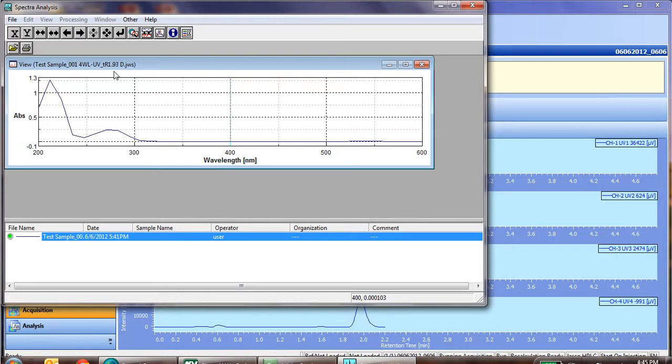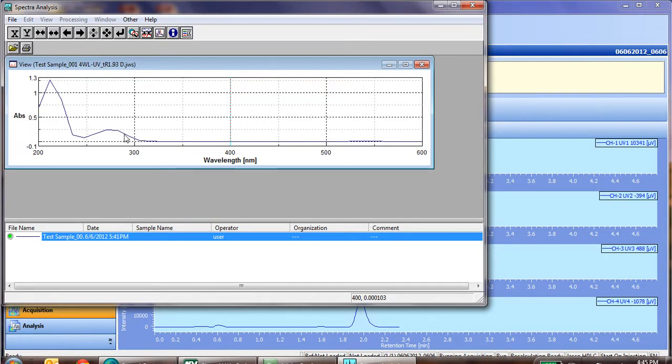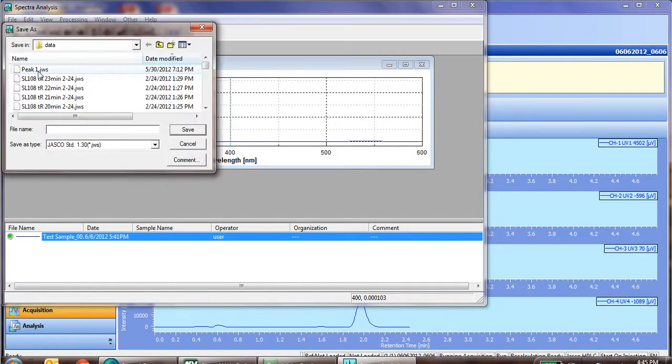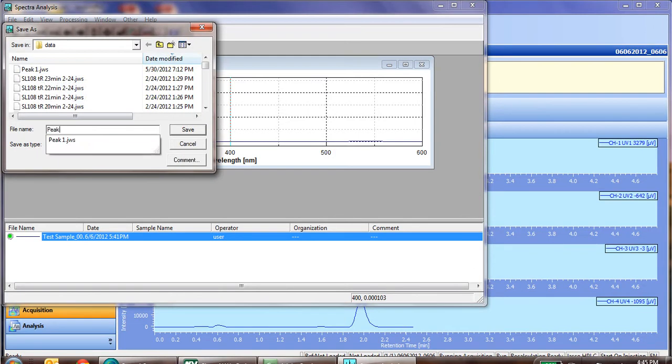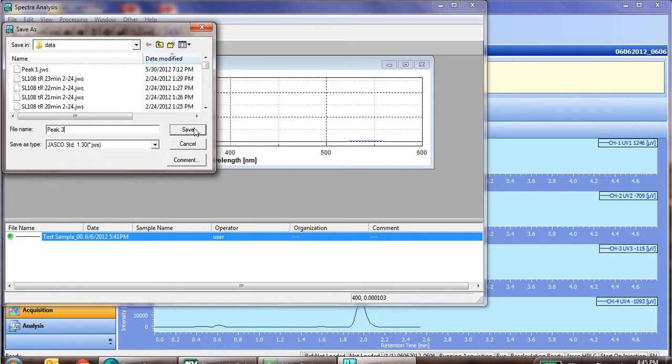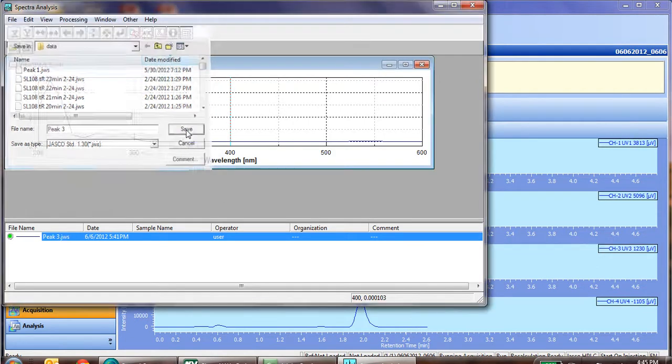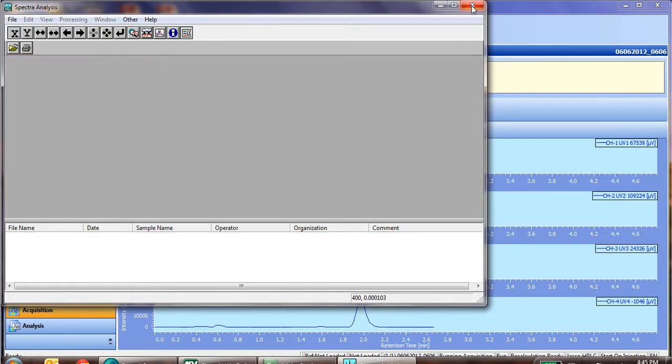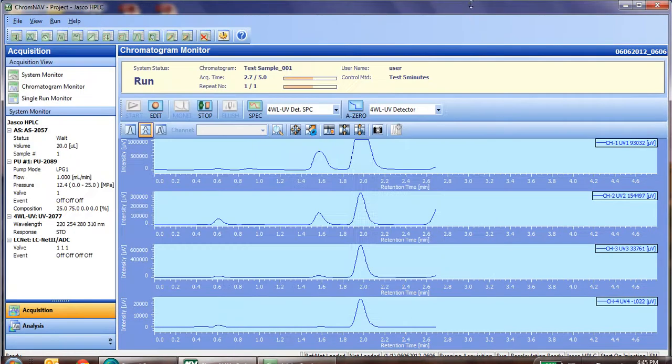So for this particular peak, which has a retention time of 1.93, and of course we see our sample name, we have our spectra for that particular compound. If we'd like to save it, file, save as, and we can call this peak number 3, as that was the third one to elute, or you can put a retention time stamp on it, and a sample name, however you'd like to name it. Click save, and now we can close it, and go back to our chromatogram.